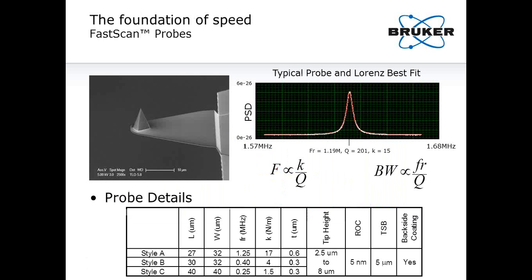All academic efforts to build faster AFM have recognized the AFM probe as a key element one needs to address to increase imaging bandwidth. Concurrent development of faster AFM and affordable, high-yield commercial probes has probably been one of the main bottlenecks to the broad adoption of high-speed AFM. For most imaging modes, the first resonance frequency is the bandwidth limiting characteristic. The resonance frequency depends on the spring constant and the mass, so to increase it, one can increase the spring constant or decrease the mass.